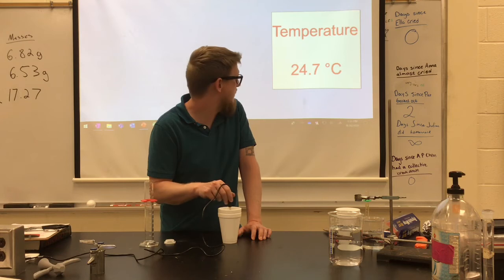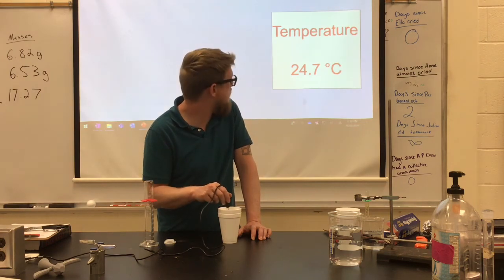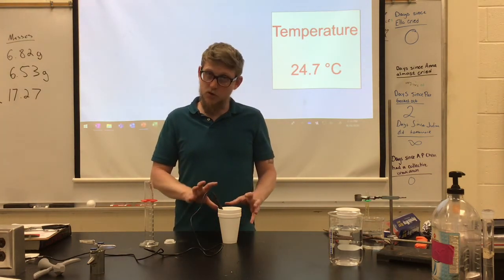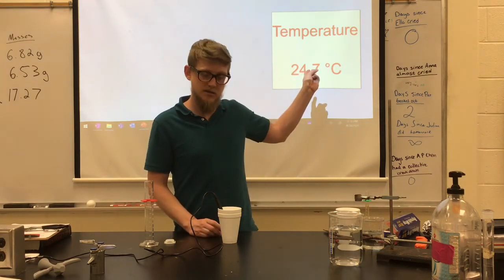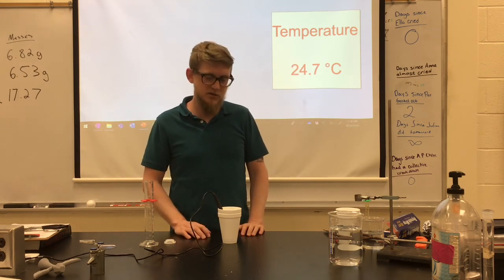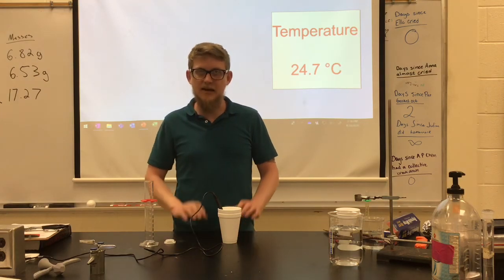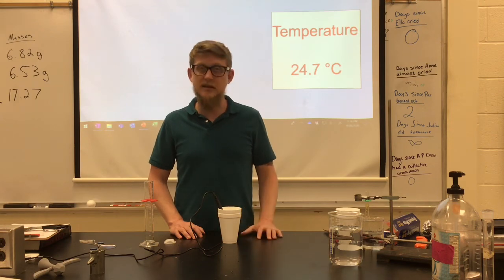The temperature went up. Think about what that means in terms of delta H. Right? What should the sign be? Is this an exo or endothermic reaction? You will need to calculate the kilojoules either absorbed or released by this solution, this water here, by using the temperature change, by using the mass of the solution, that should come from 200 milliliters of total solution, and use the specific heat of water, right? Use that and the moles of acid to calculate delta H. It's all in the analysis. Make sure you carefully read through and answer the analysis questions.